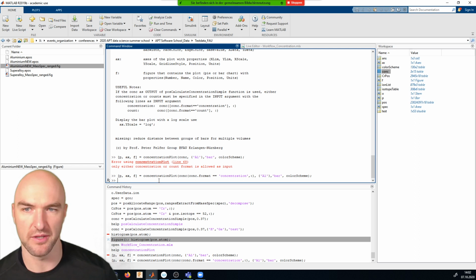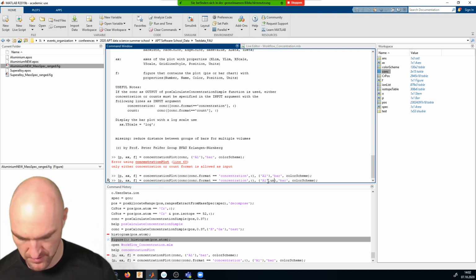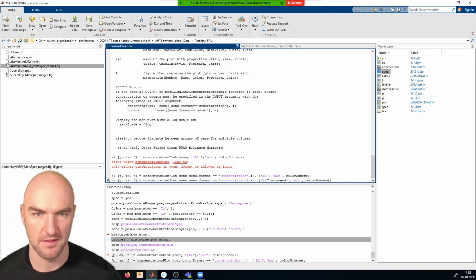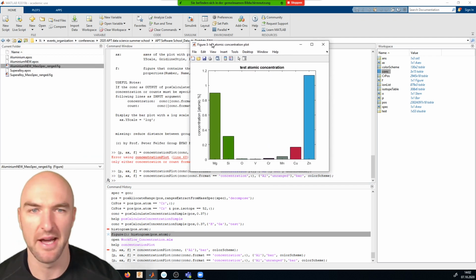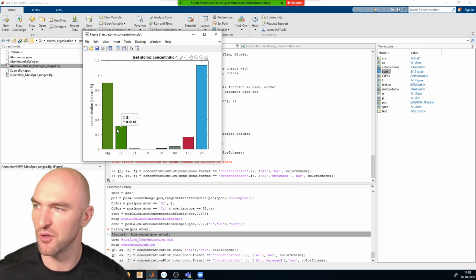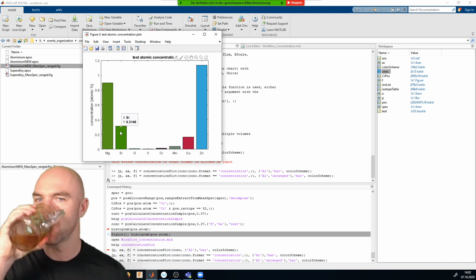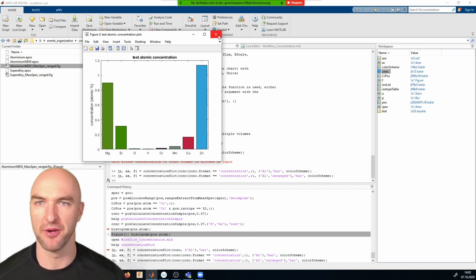But we can also exclude the unranged events. And now we get everything with just the elements that we're interested in. With this color scheme, obviously, it's a little bit unlucky. Magnesium and silicon are very close in color, but I could go into the color scheme and change it at any point and rerun the analysis.